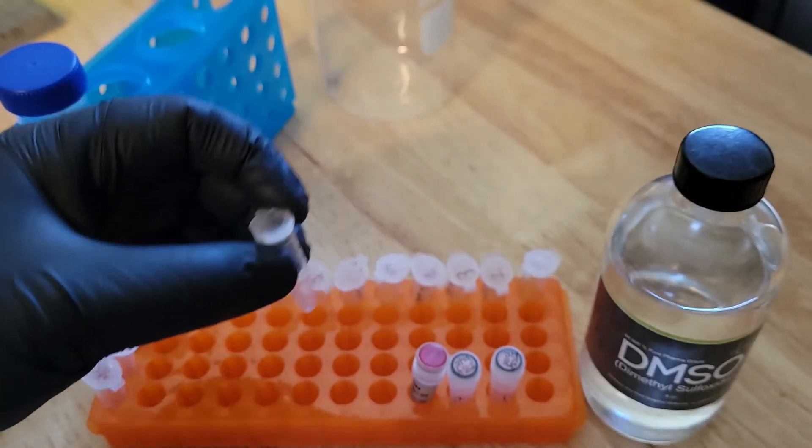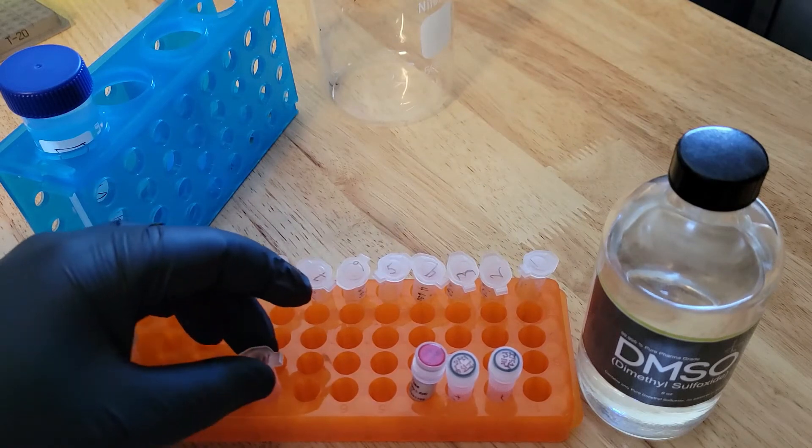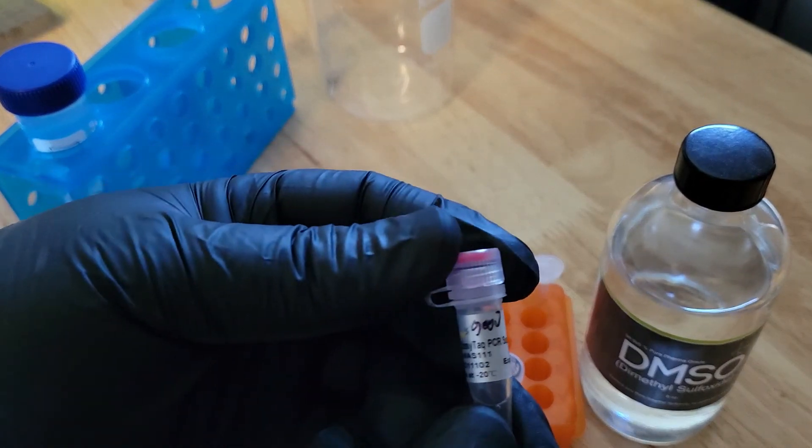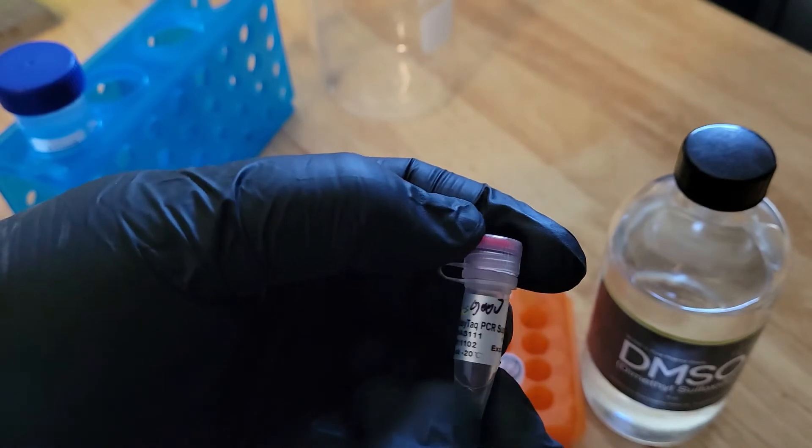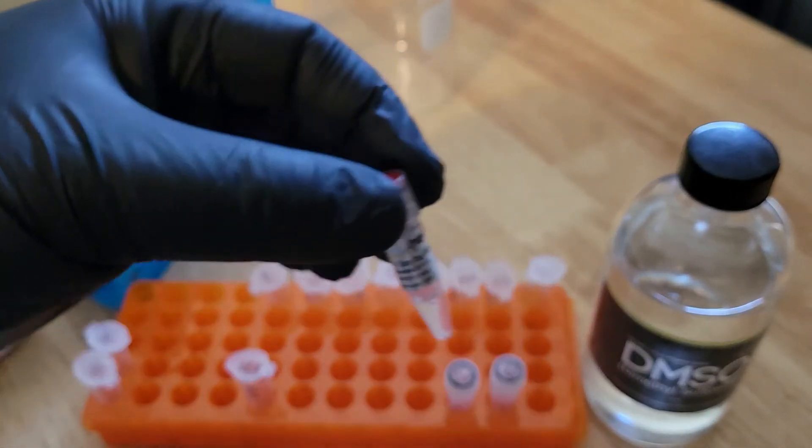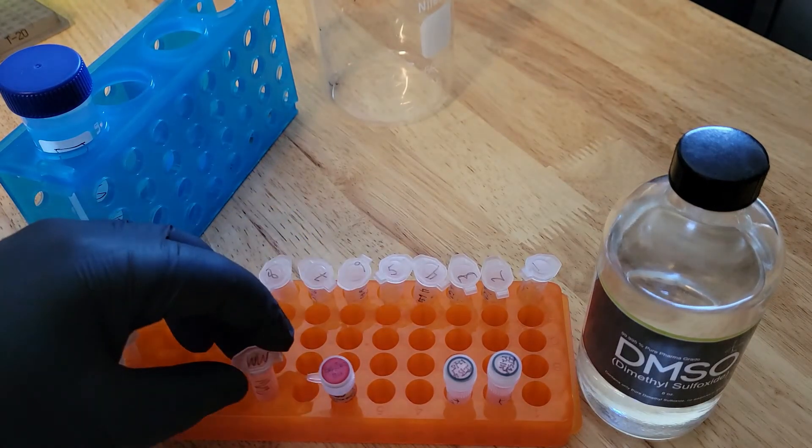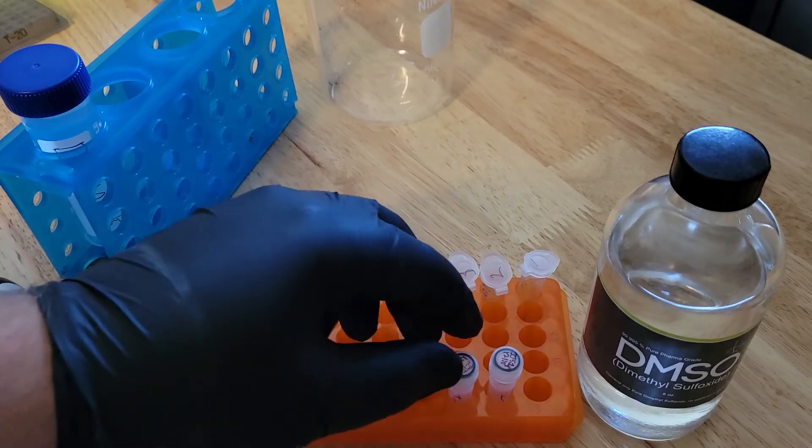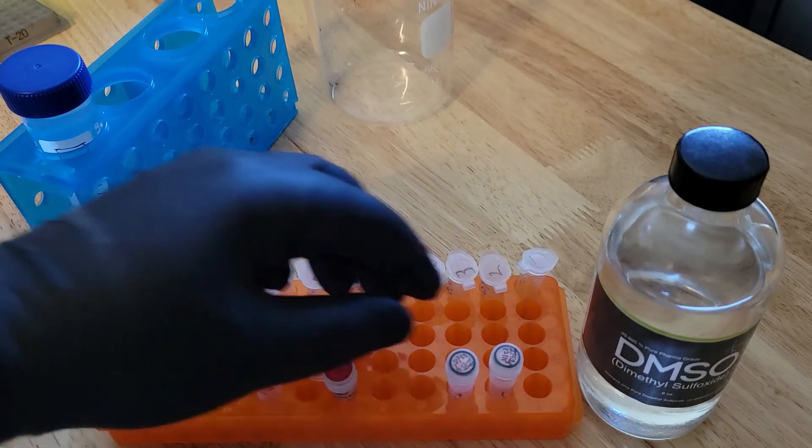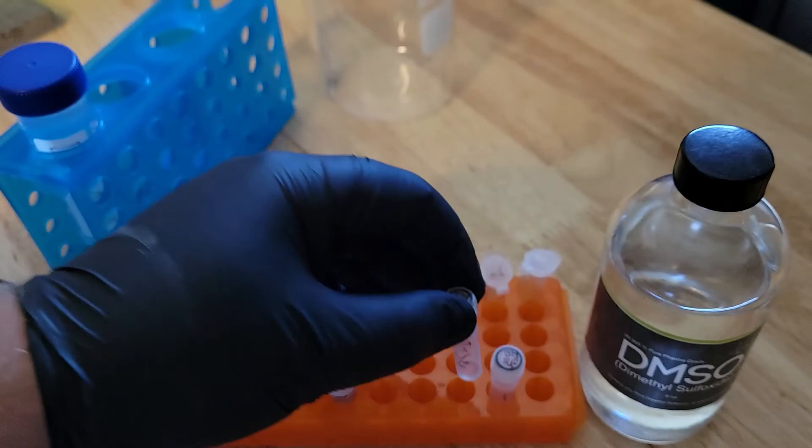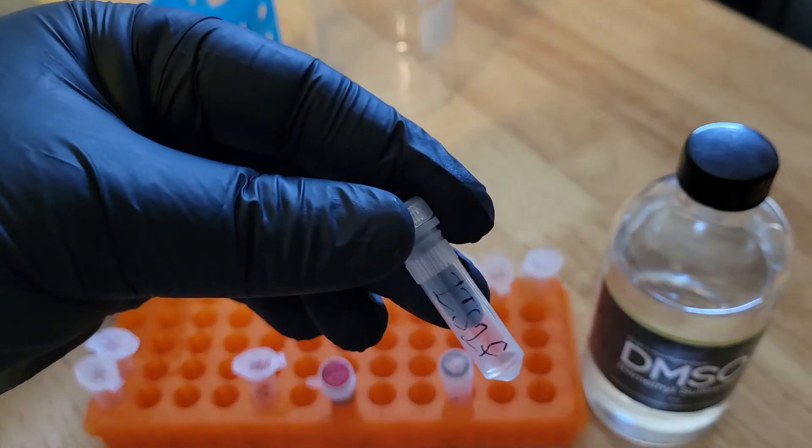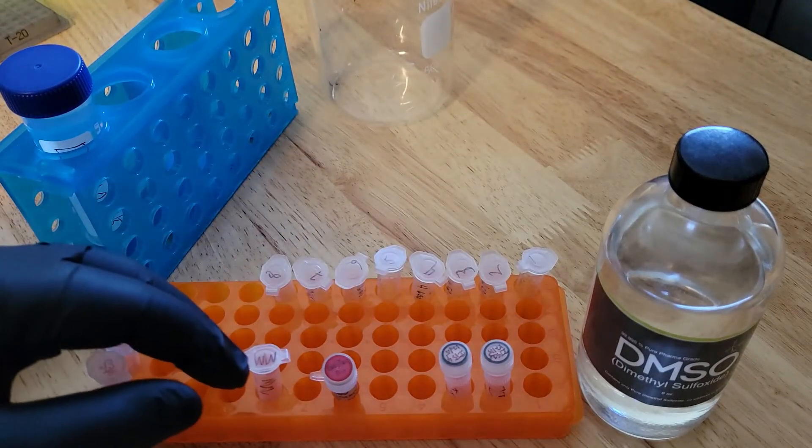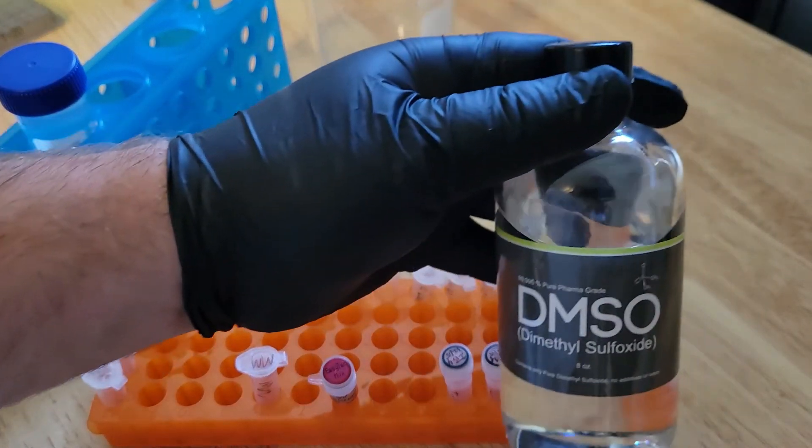We're going to make our master mix. I'm not going to show you the pipetting part, but here's the main ingredient. This is our 2X PCR master mix. It includes some magnesium chloride, the Taq polymerase, and then each of the four nucleotide bases. In this case, they're in their triphosphate form. Then I've got the ITS4 reverse primer.